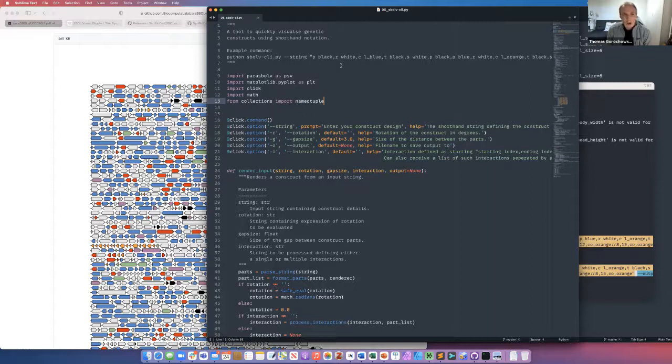I guess there's a lot of functionality missing, but the functionality it provides makes it very easy for you to not have to worry about the visualization bit. You just need to think about how you want it to draw things and where. So that element is sort of taken out of it.